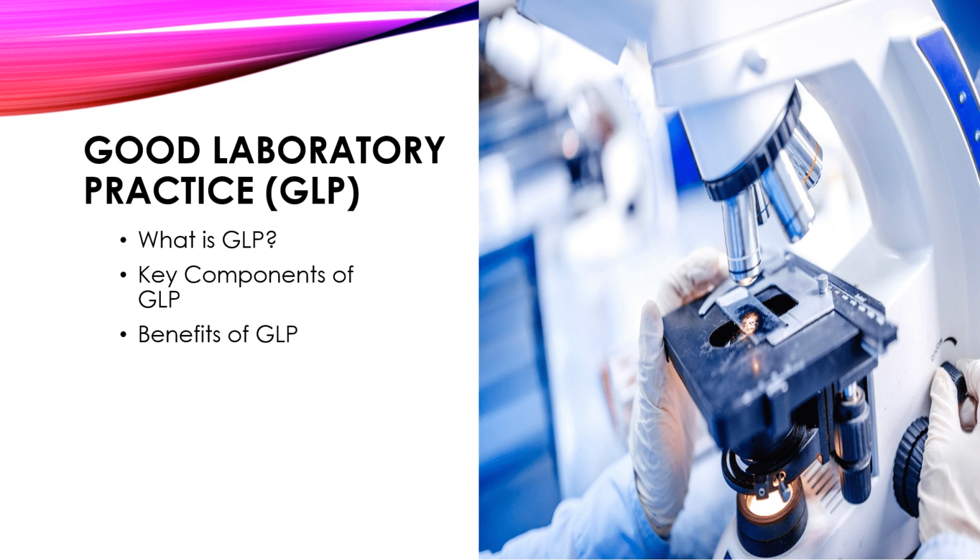Documentation and record keeping. Good laboratory practice emphasizes the importance of accurate and comprehensive documentation throughout the entire study process. This includes recording experimental procedures, observations, raw data, calculations, and any deviation from the protocol. Proper documentation facilitates traceability, auditability, and reproducibility of results.